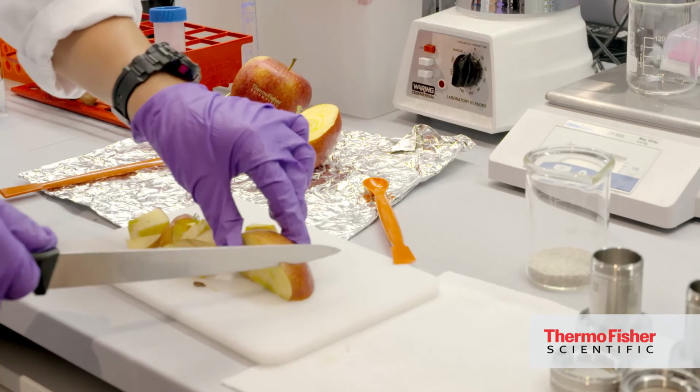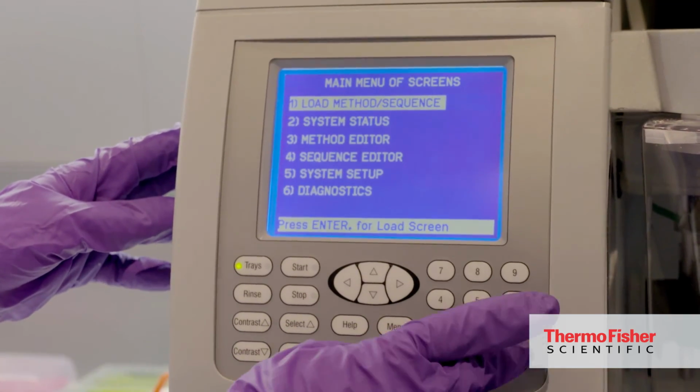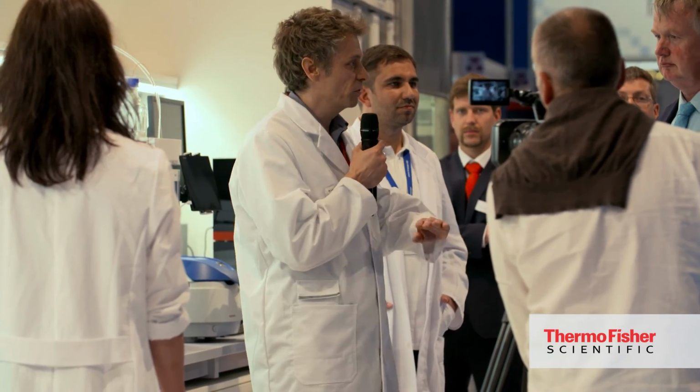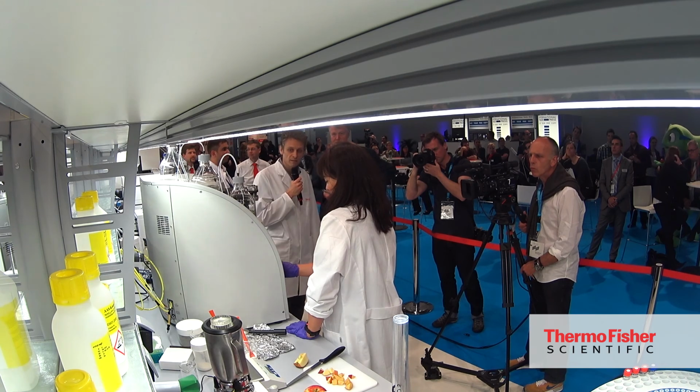What we've done here during the live lab is a full sample preparation. We just took some apples and we demonstrated here for the audience a whole method procedure, how we just clean up a sample and what is really the workflow for pesticide analysis.